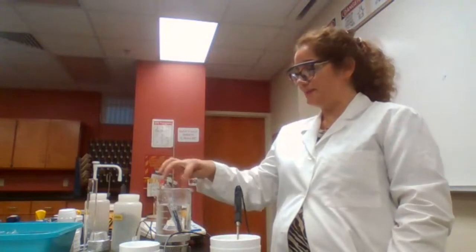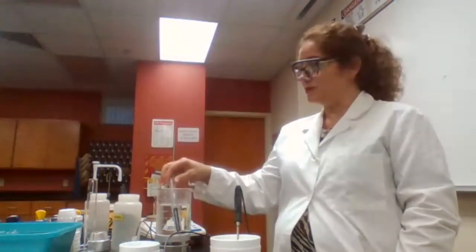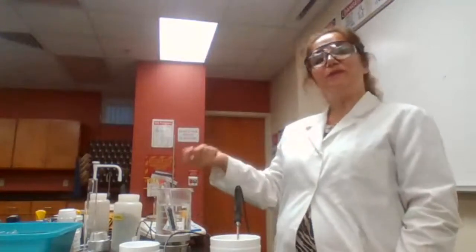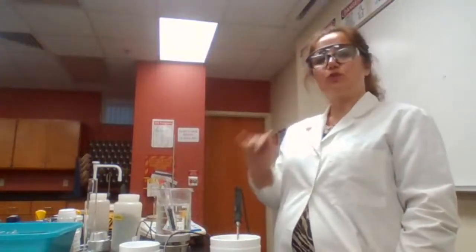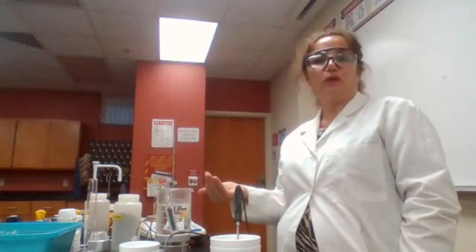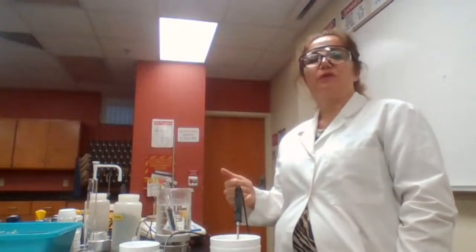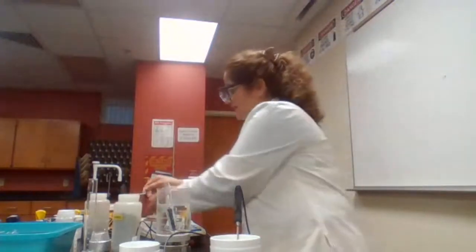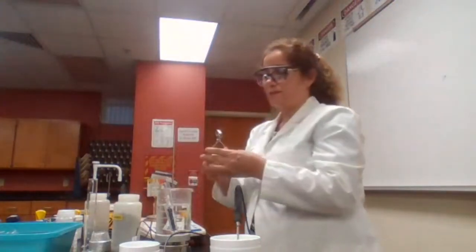The temperature inside the test tube is not going to be higher than the temperature of the water. But if we take it out early, that temperature could be less than the temperature of the hot water. So it's better to be safe, so we can keep it for longer. Just in 30 seconds, we make sure that we have more than 5 minutes, at least 5 minutes.